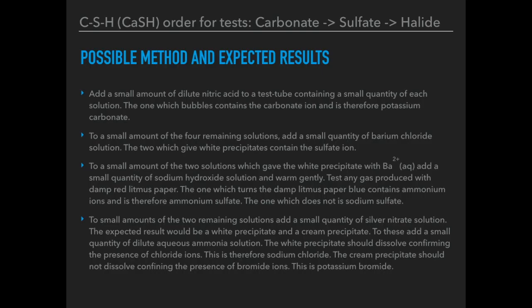For the two remaining solutions, we add a small quantity of silver nitrate solution to each. The expected results are a white precipitate in one and a cream precipitate in the other. Since these can look very similar, a confirmation test is carried out: adding a small quantity of dilute aqueous ammonia solution. The white precipitate dissolves, confirming chloride ions, so that solution is sodium chloride. The cream precipitate does not fully dissolve, confirming bromide ions, so that solution is potassium bromide.